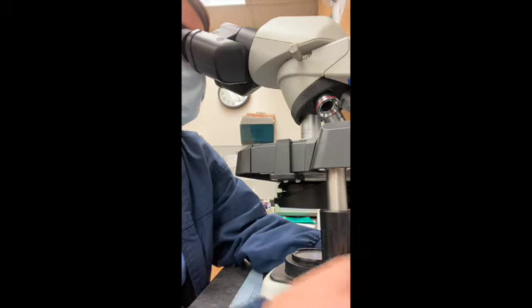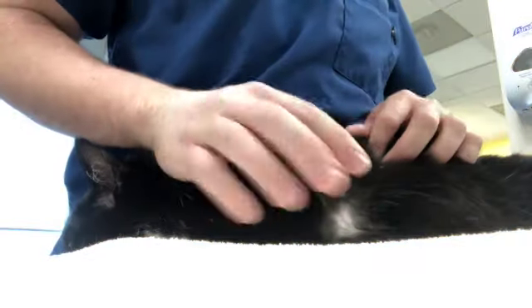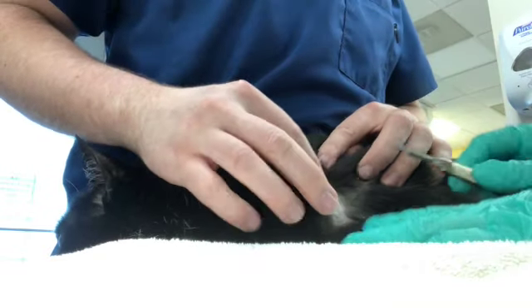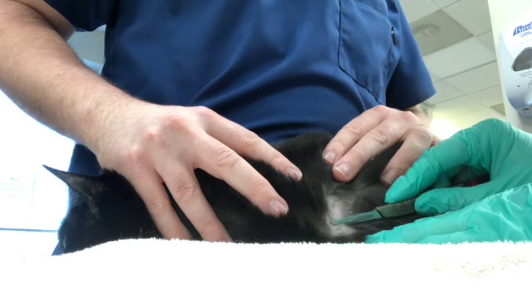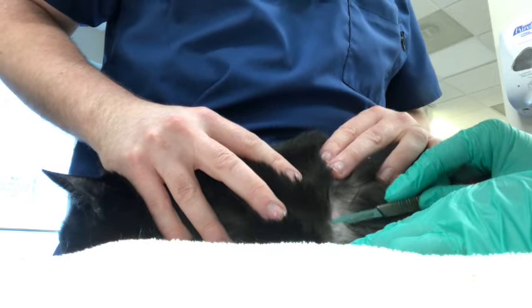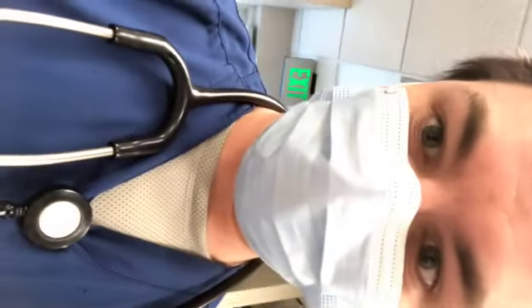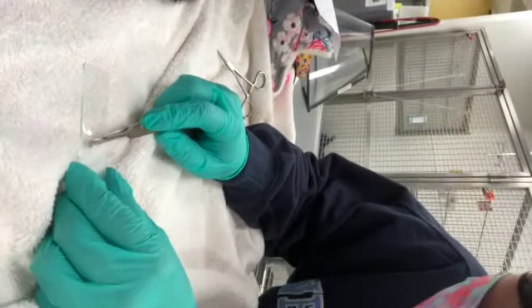Then here we're going to do our skin scrape. I have a scalpel and I have lubricated it up with immersion oil. I'm going to lightly scrape the skin to lacerate it slightly so that we get some sample onto the scalpel blade. Once the skin sample is collected, we'll go ahead and place it on our microscope slide for microscopic evaluation.